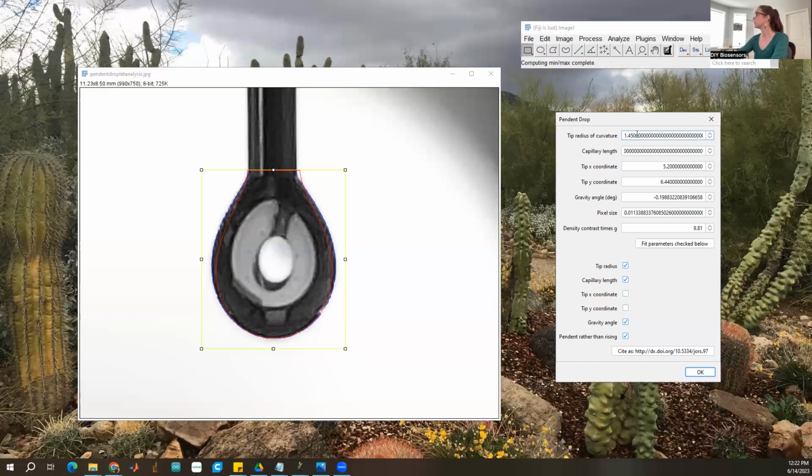As you can see, it's just a little bit of trial and error. I'm a little annoyed that I don't know why it's suddenly having, like, I can't see the numbers. I'm sure it's fine though. Let's try an automatic fit. Let's see what it gives us. Oh, that's really good. That's really good. Okay, I should have just let it do its thing.